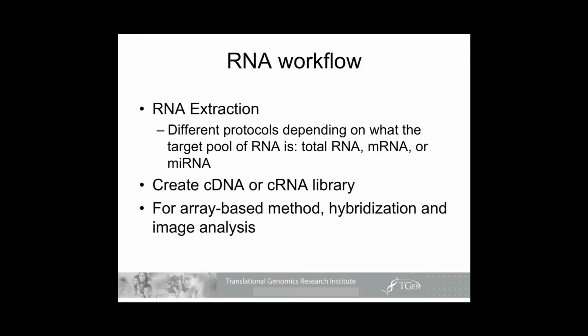You either create a cDNA or a cRNA library depending upon the technology. And for the array-based method, you have a hybridization and image analysis. This has been pretty well covered, so I'm not going to go over it in depth.